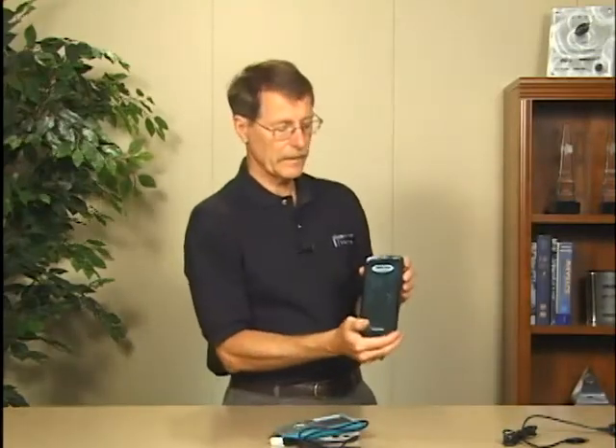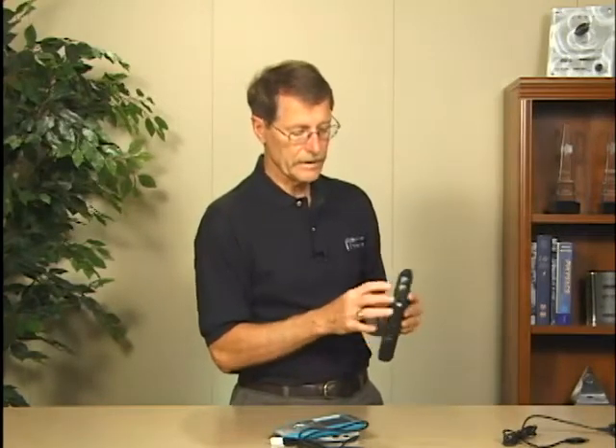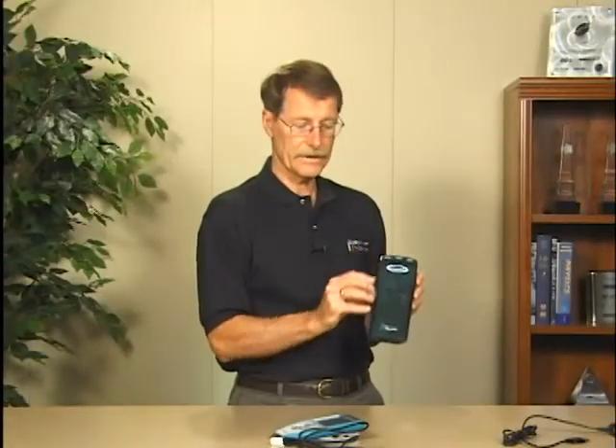Another option is our LabPro, which has been around longer. LabPro connects to a computer either by a serial or USB connection. It has six sensor ports like the LabQuest, and it can be used either with a computer or with a TI graphing calculator on top.